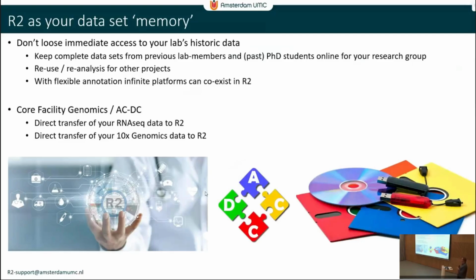But essentially data that was produced there from experiments can still be used today in conjunction with the latest technologies that we have. And sometimes there are really interesting patterns that we keep on rediscovering, which normally you would forget. But since the data is there anyway, you more quickly just have a look at data from your PhD student, data from a student that has been entered to the platform.